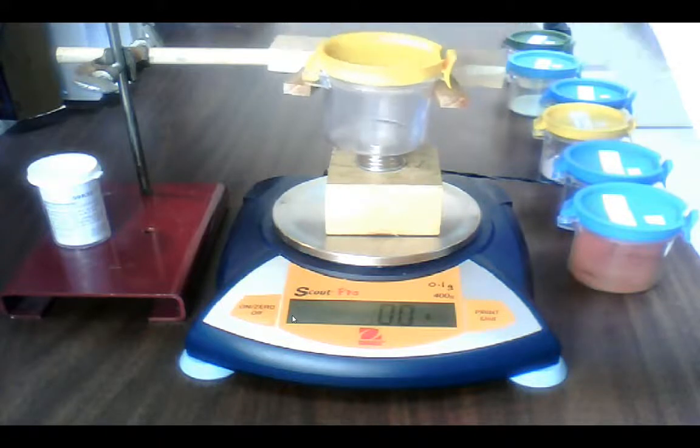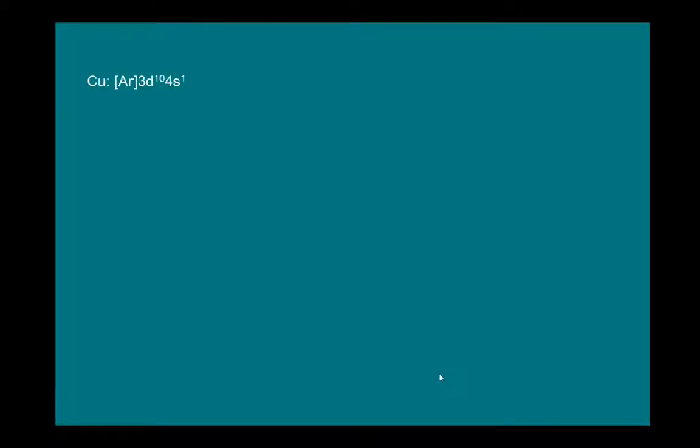And then we can make the measurements. So let's take some examples here. Here's copper, copper atom. Now, copper oxide, as we saw in the first slide, looks like this. And so we would expect since they're all paired up, their magnetic fields will cancel out and there will be no effect. So let's check this out.